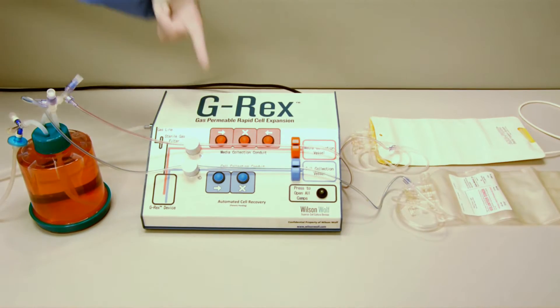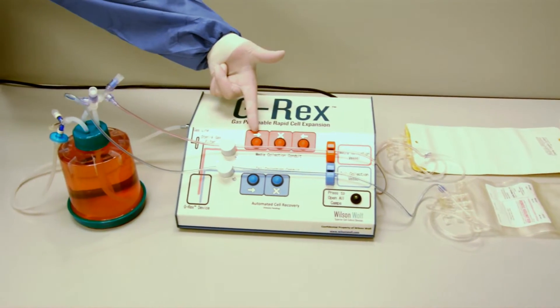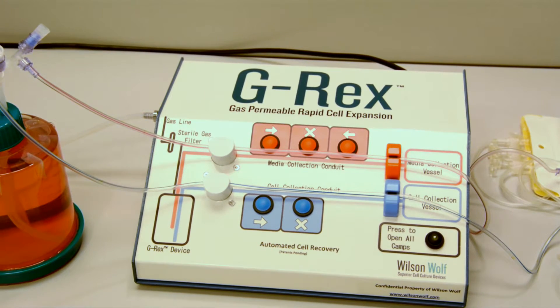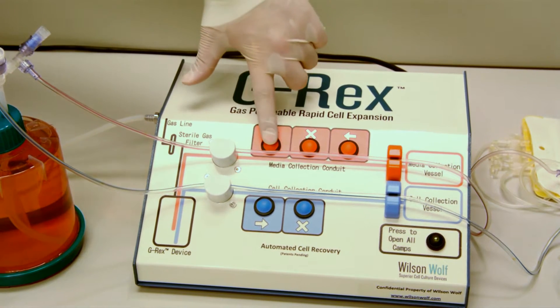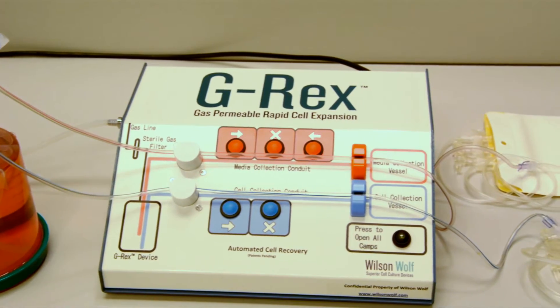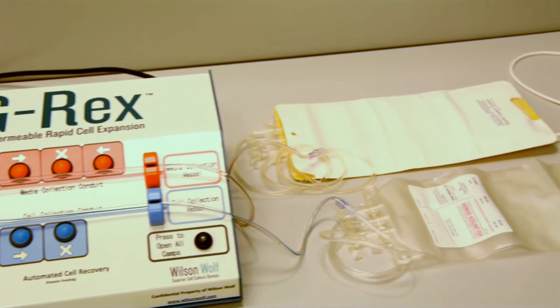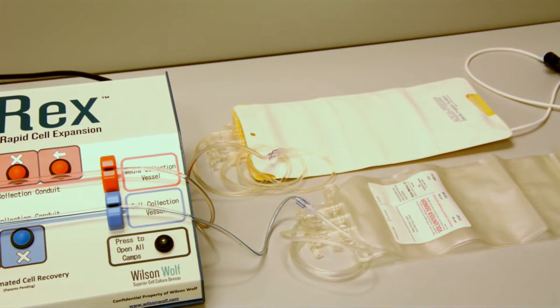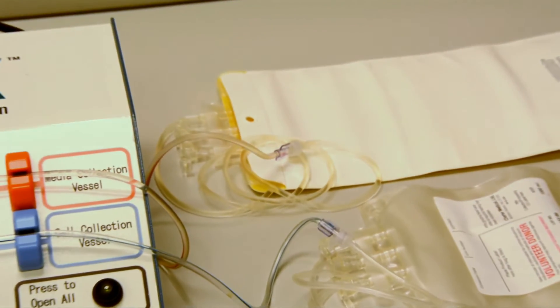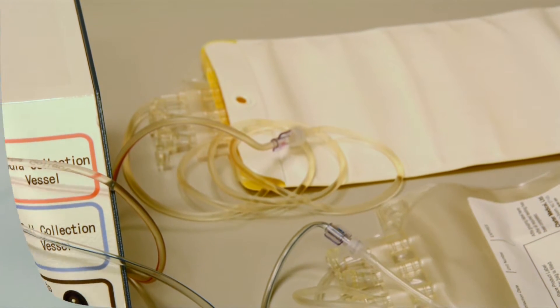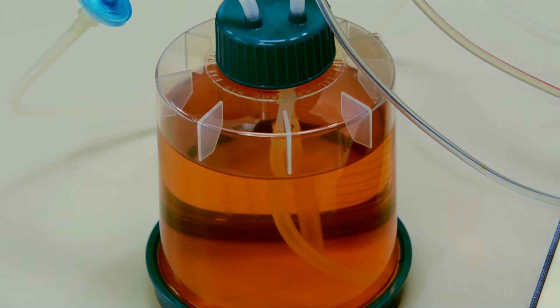Now, we are ready to drain the excess media above the cells by simply pressing the medium collection button. This pressurizes the G-REX and allows the culture medium to flow through the line and collect in the medium bag. This process stops automatically when the optical detector senses air bubbles in the tubing and shuts off the medium clamp, leaving about 10% of the media volume in the G-REX.